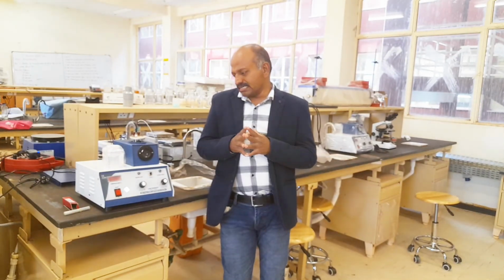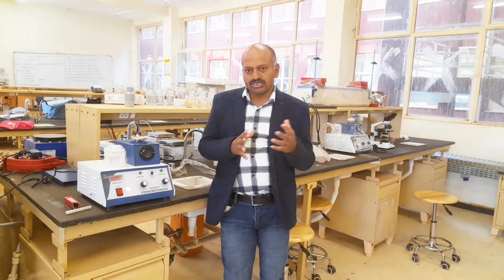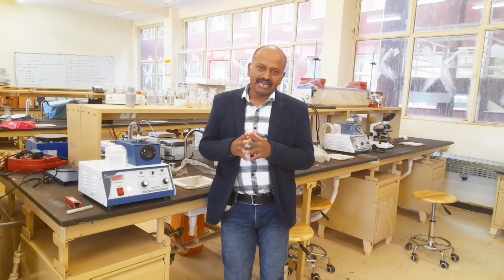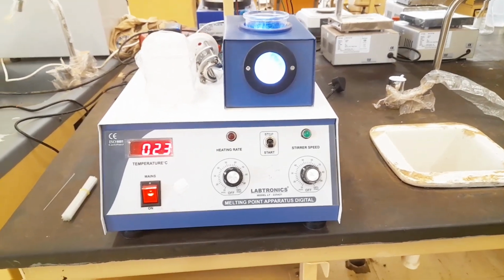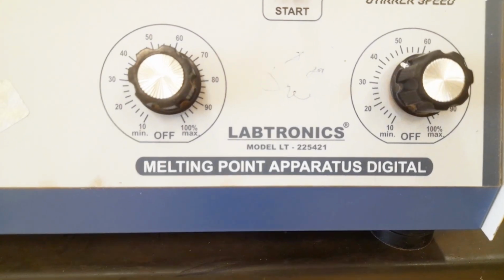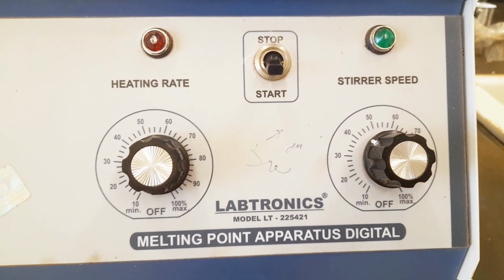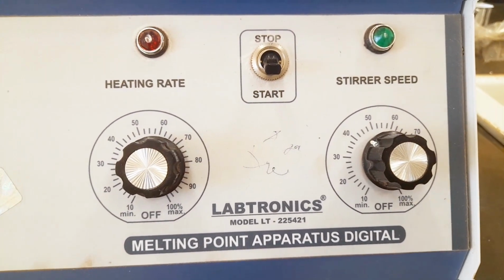Now let us understand the instrument and see the demonstration of how the melting point apparatus actually works. This is the Labtronics digital melting point apparatus. There are different options here, and different knobs which we have to operate properly.